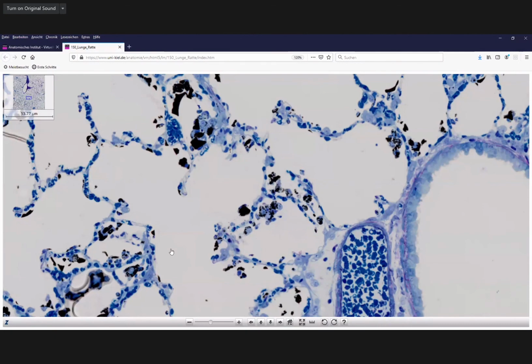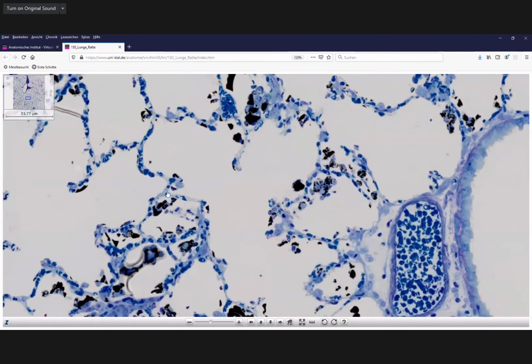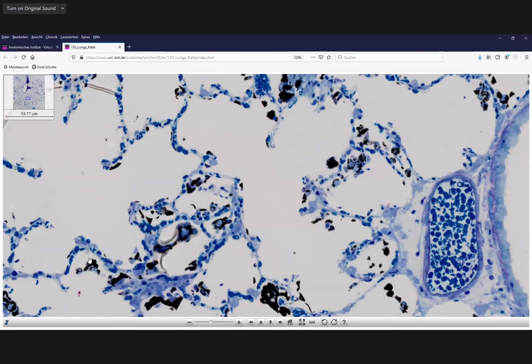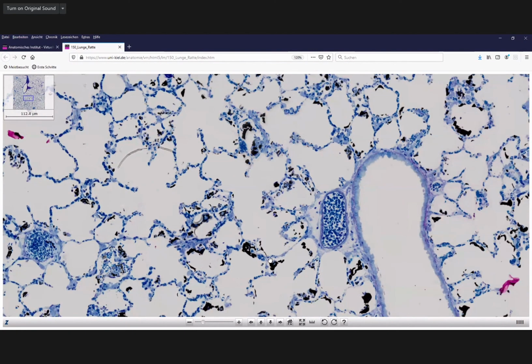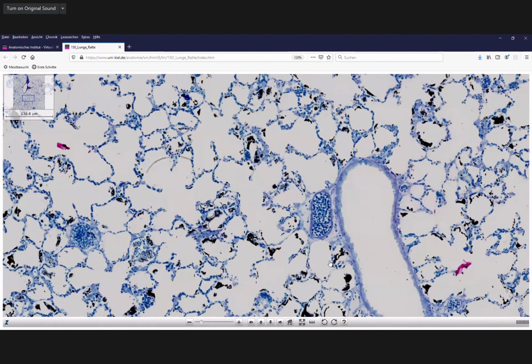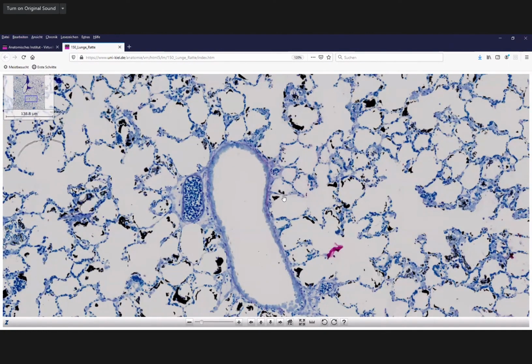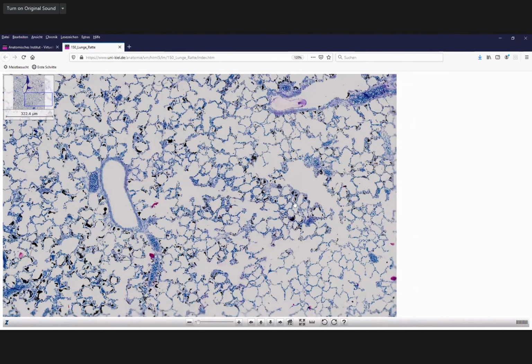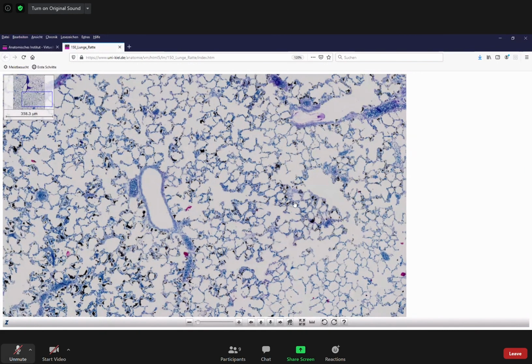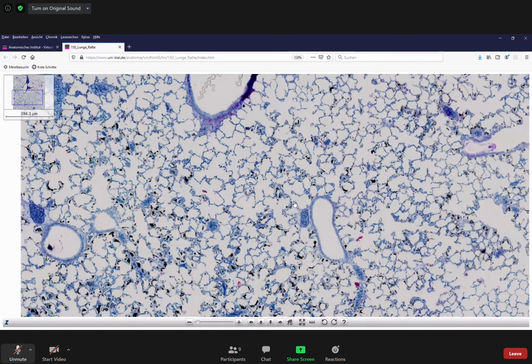There are still some more cells, some fibroblasts and so, but they are hard to find. So we probably should not spend too much time for that. Any questions related to what we talked about right now? Not the case?